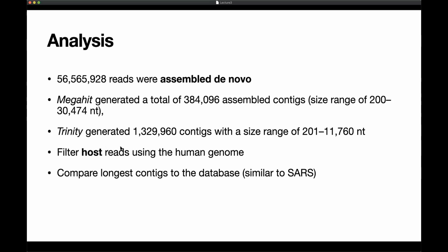At this point, you take this and filter it against the human genome. So basically see, do any of these sequences look like they came from a human? And if they did, you throw them out. So this is computational subtraction. And you do this by querying a database of the entire human genome using a specialized piece of software to do it quickly. Bowtie short read mapping.